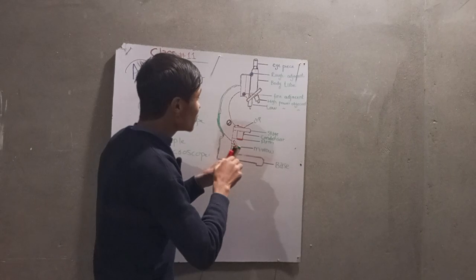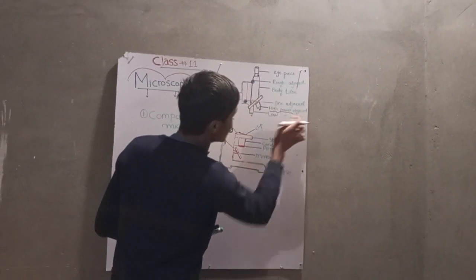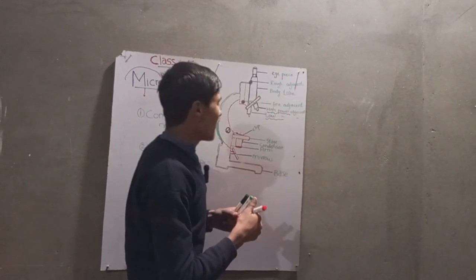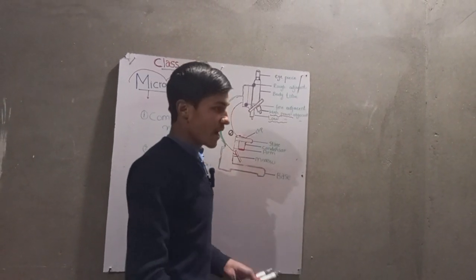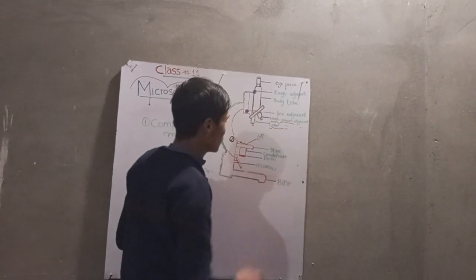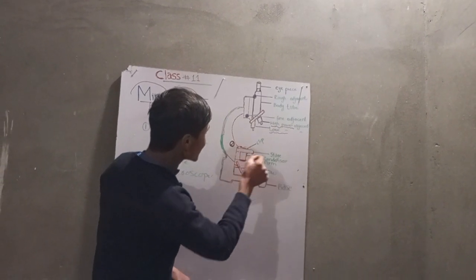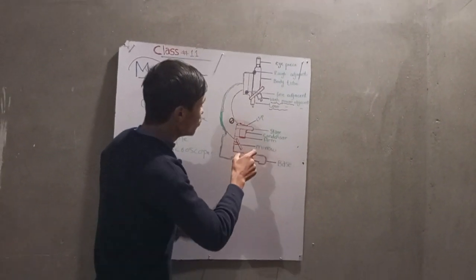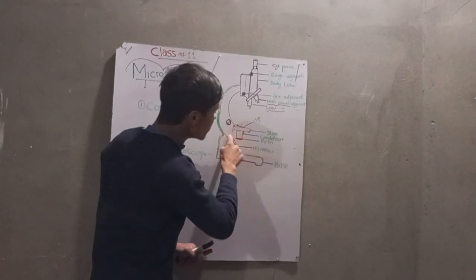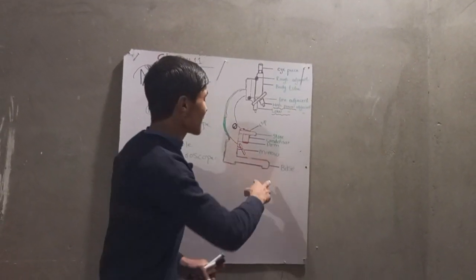If the object is very small, we see it under the high power objective, and an object a little bigger compared to viruses and very small organisms we see on the low power objective lens. There is a clip that helps to keep the specimen in place on the stage, and there is a condenser, arms, a mirror that helps reflect the light on the specimen, and a base.